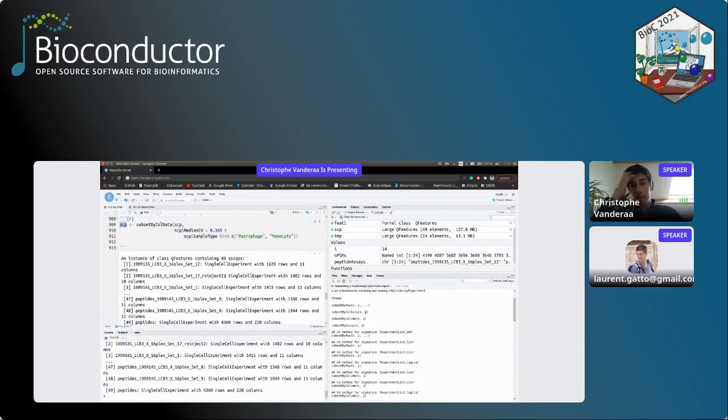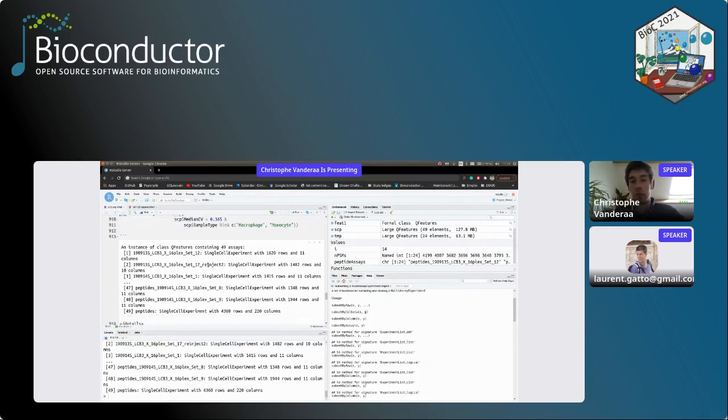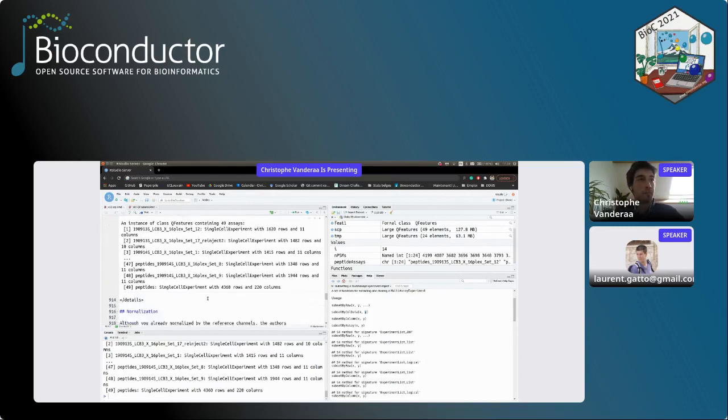Okay, so that's it for the singles. Filtering on single cells again. From RNA-seq, there are other very interesting metrics that you could use, like for instance the median intensity. In this case, in proteomics, it doesn't work. I'll be happy to explain this later on if we have time, but I'm afraid we don't have time. But you may think of any other metrics on samples on single cells that you could apply to get the best data out of it, or at least remove the data that is not useful, or that could bias some analysis.